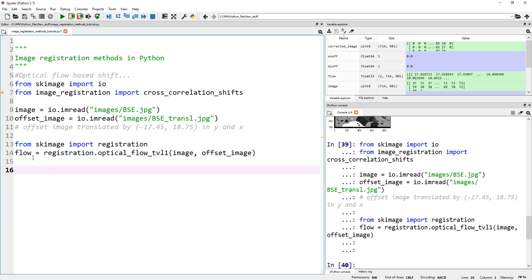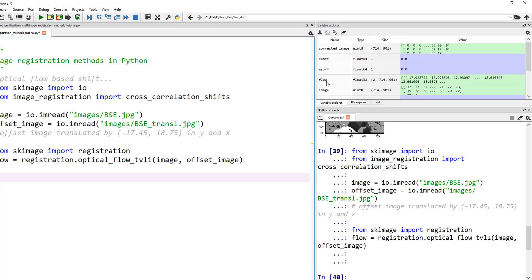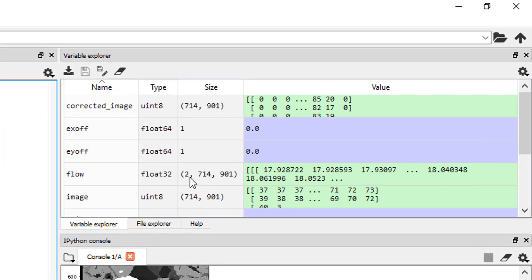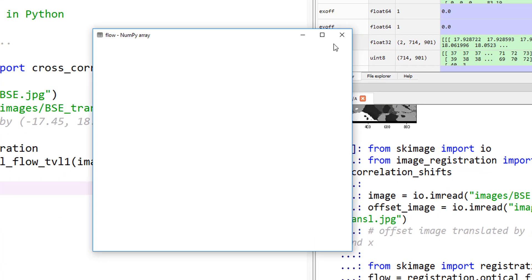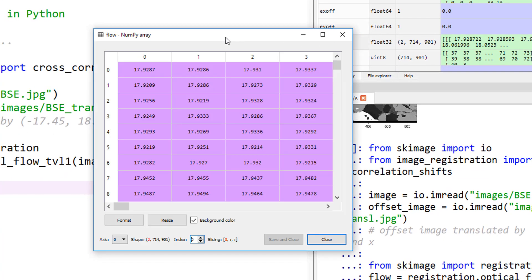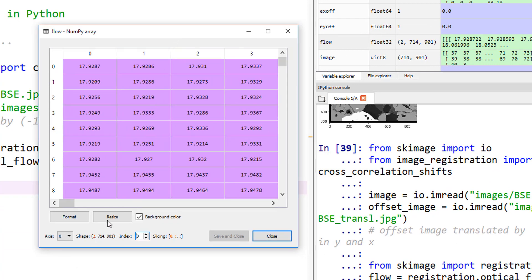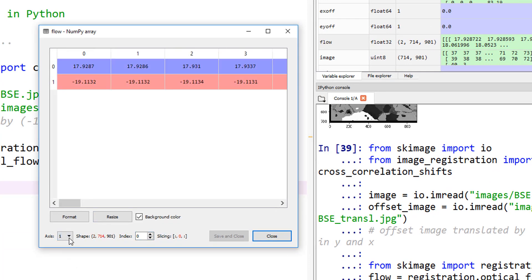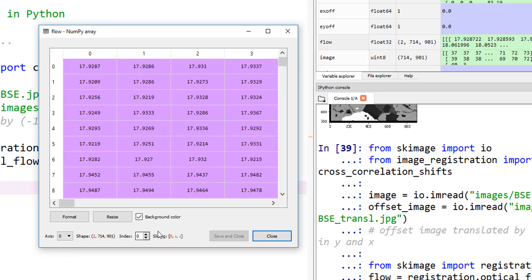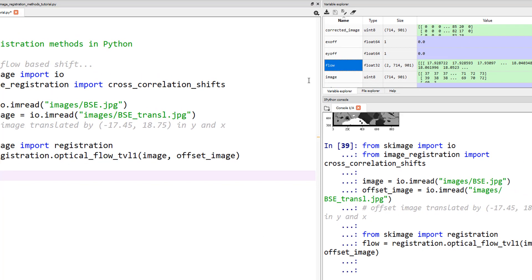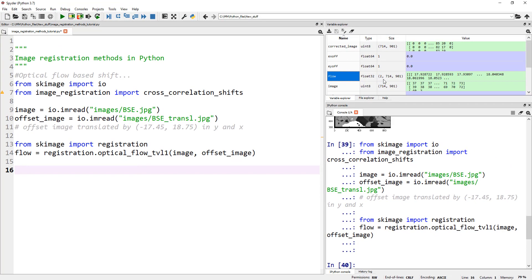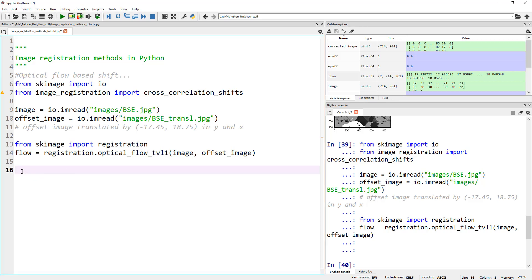Now we actually have flow. If I open this flow, it's actually a tuple. The size of this flow is 2 by 714 by 901. 714 by 901 is our image size, and these two correspond to an array for x and an array for y. You should see there's one for x and one for y. Now what do we do with that information? The first one corresponds to y - I did a bit of research on this. The first one corresponds to y and the second one corresponds to x. Let's extract those two values.